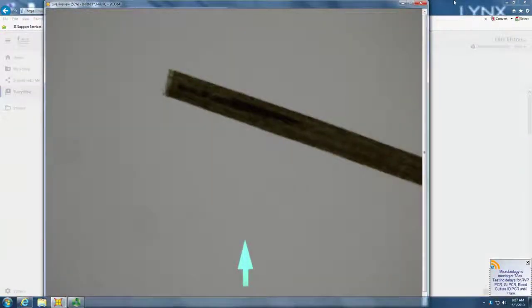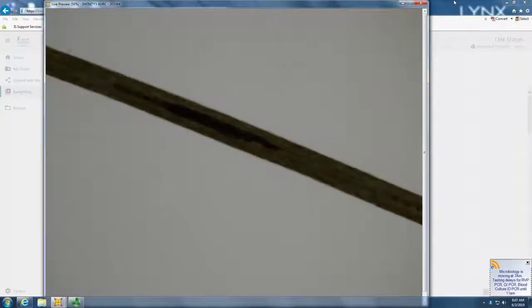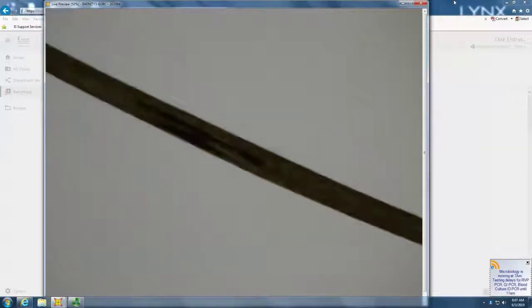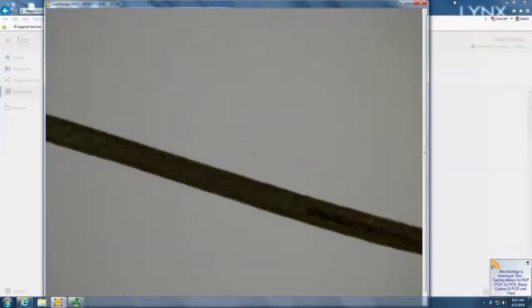So we have a hair shaft. And it looks like there's pigment in the middle. Pigment, or that's actually airspace when it looks black like that. And is it continuous or discontinuous? Discontinuous. And so what is that abnormality? Is it trichorrhexis nodosa? No, that's a breakage of the hair shaft. This is just a discontinuous airspace that's pili annulati. It gives you sparkly, spangled hair.